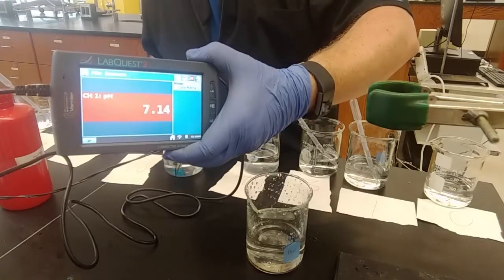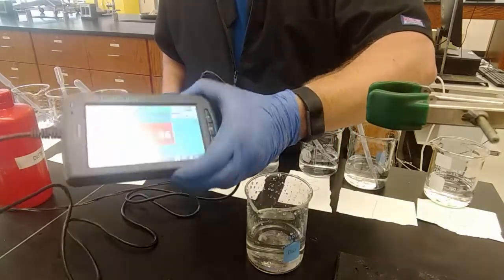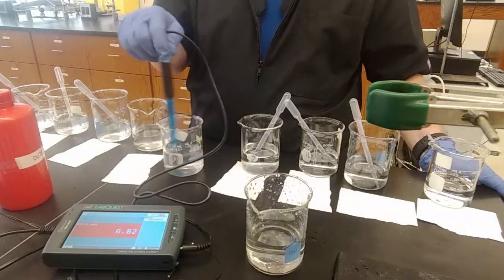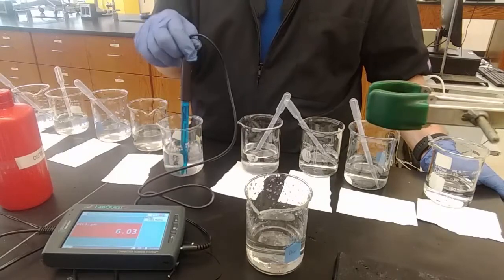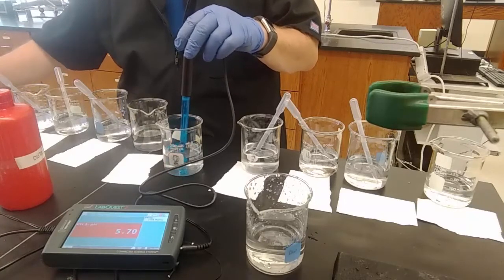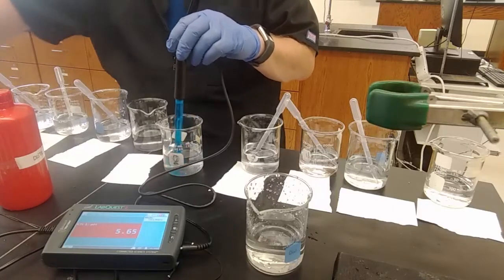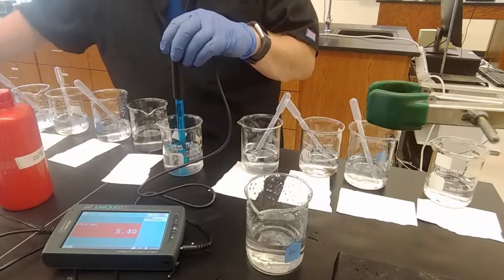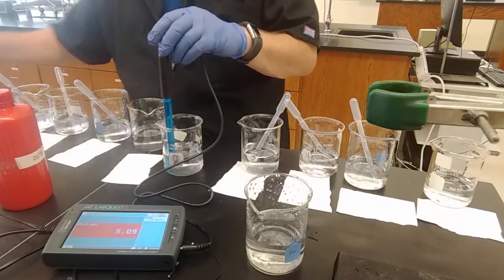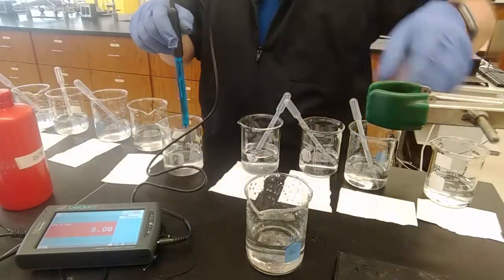Let's see, maybe we'll hold. Maybe our water is deionized. Always good to repeat your experiment, if not 3 times, at least twice. No, we're dropping into the 6s. So I think we'll stick with our original reading that our water is seemingly very acidic. Just see if I have a note on that from in the past. But I don't think that I do. No. Just notes that this lab doesn't work very well. We're definitely going to hit into the 4s, so we'll stick with our original value that we had before.